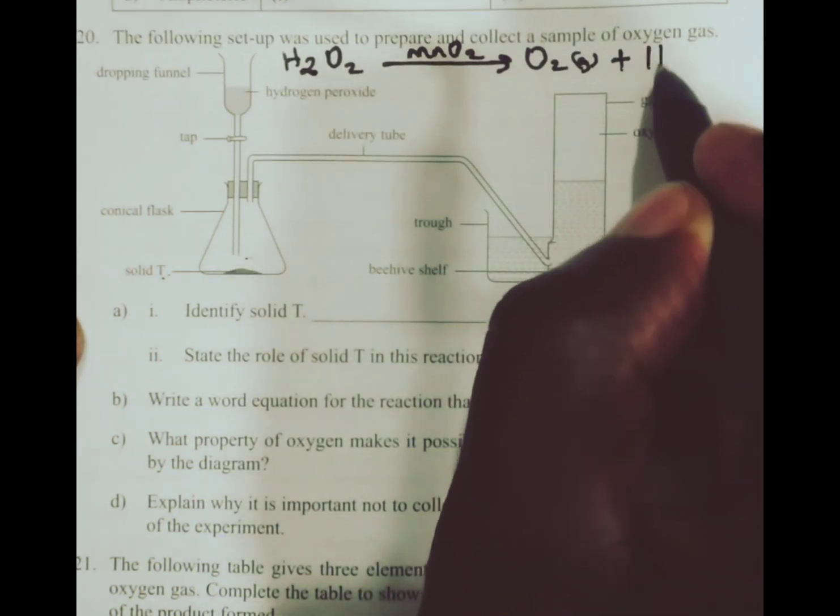Hydrogen peroxide, which has a chemical formula of H2O2, decomposes in the presence of manganese(IV) oxide catalyst to liberate oxygen gas and water.